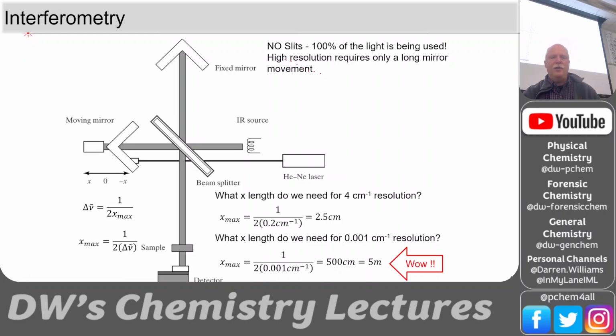This is interferometry. So notice this is one of the biggest features of an interferometer, that there are no slits. 100% of the light goes through.